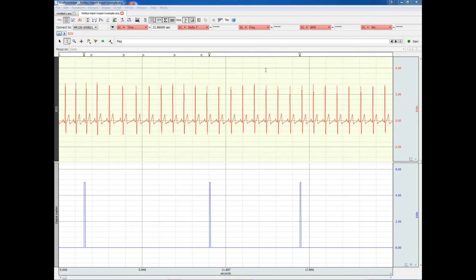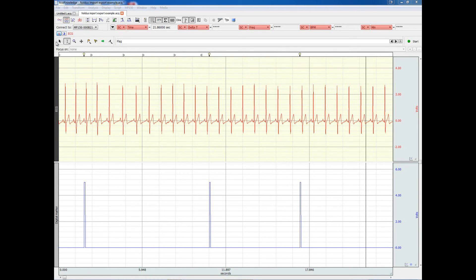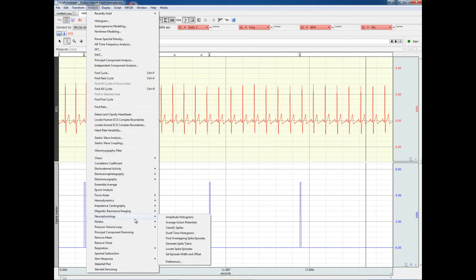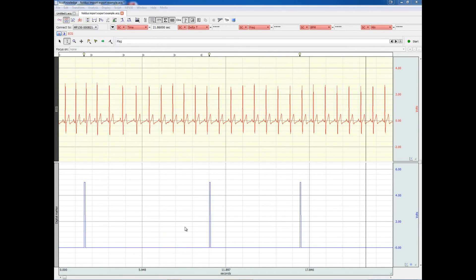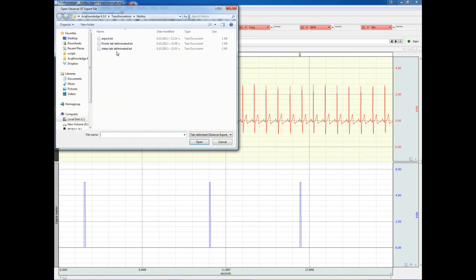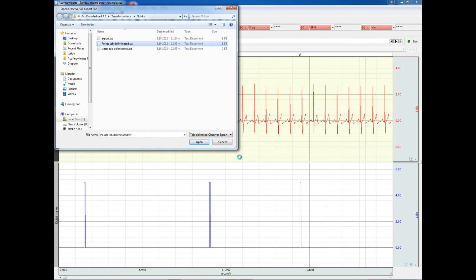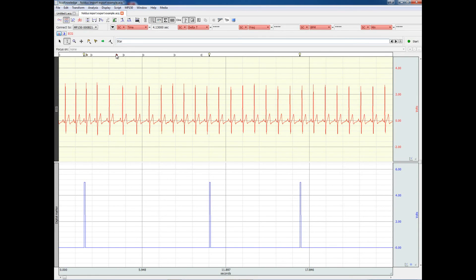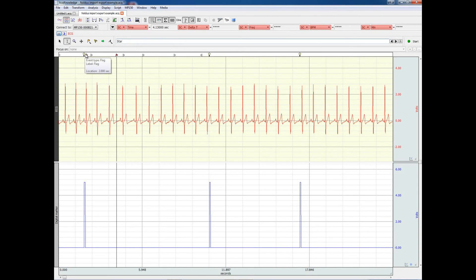Just the same way, we can import point events. Again, we go to ANALYSIS NODES, Import Markers, this time we choose the points, tab-delimited events, and here are two flags that indicate when the different events occurred, and the label of the events.